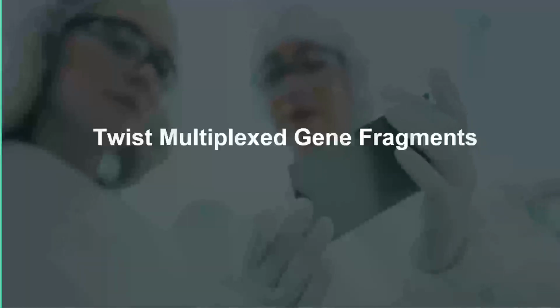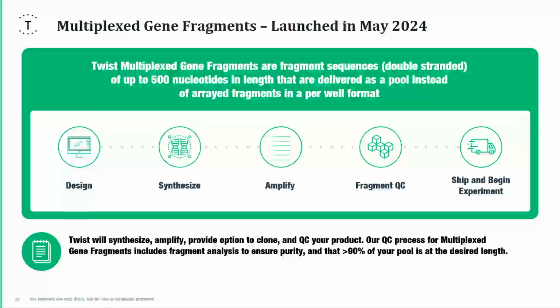There were several reasons why we expanded the diversity, but one of those reasons was that to build 10,000 gene fragments to then pool into a library is actually not as cost-effective as building a combinatorial library that incorporates those 10,000 sequences. So that case study predated our new product, Multiplex gene fragments. And perhaps if we had this product, we may have done things differently for that particular case study.